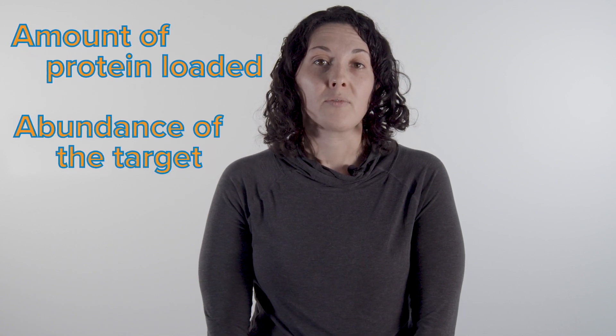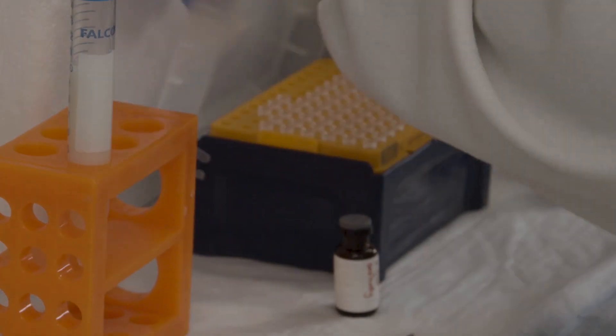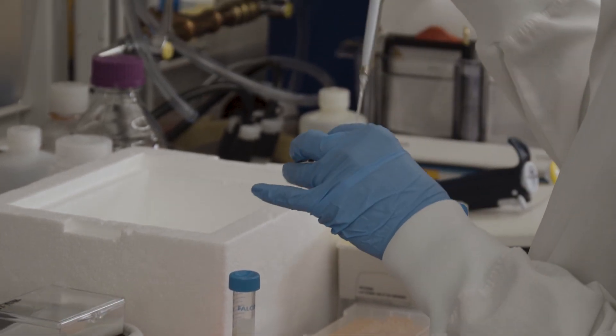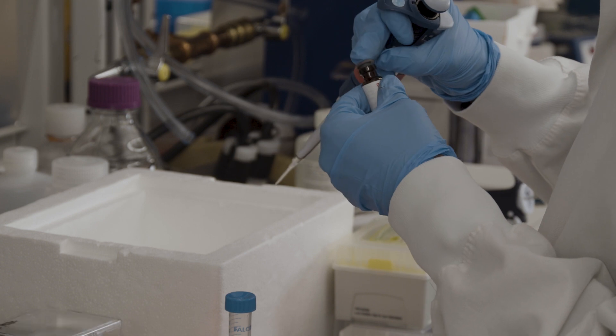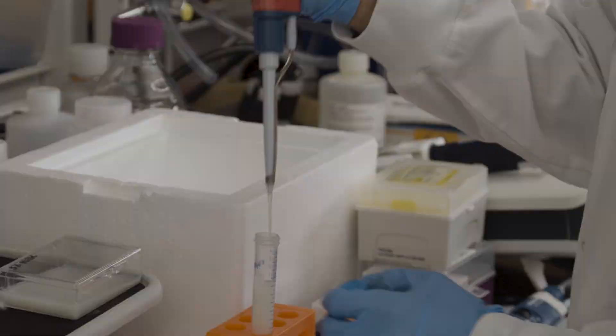You'll need your antibody diluted in a blocking buffer in a large enough amount to cover the membrane during incubation. The concentration of the primary antibody depends on a number of factors, such as the amount of protein loaded, abundance of the target, and affinity of the antibody to its target. You may need to try a range of different concentrations before uncovering the ideal conditions. If the ideal concentration for your conditions are unknown, try starting with one microgram per milliliter and optimize from there.